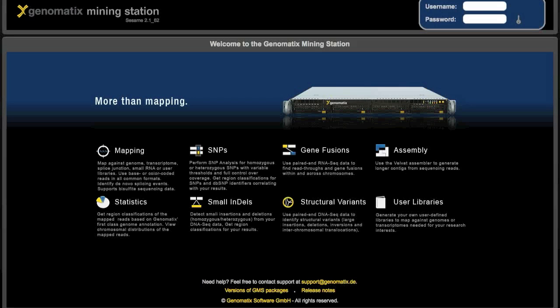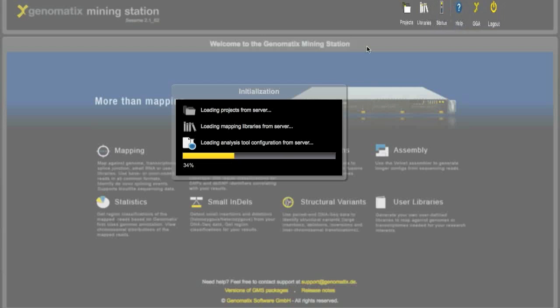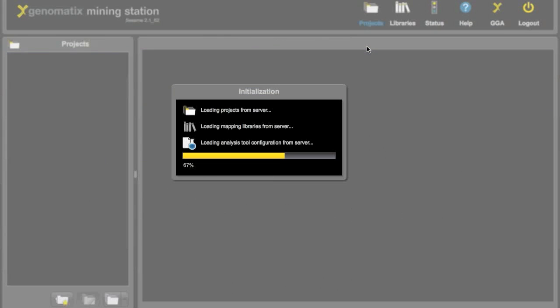To use the genomics mining station you first have to log in with the username and password. So we enter these up here and after authenticating the system will transfer us to the projects list.